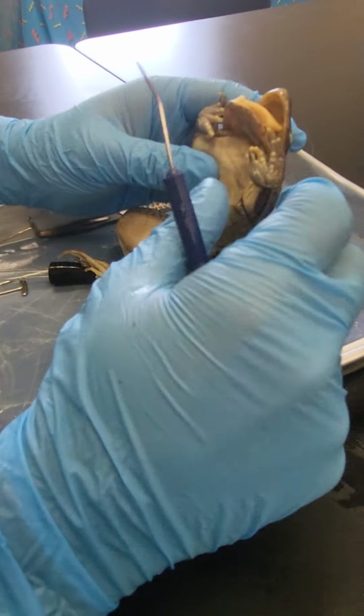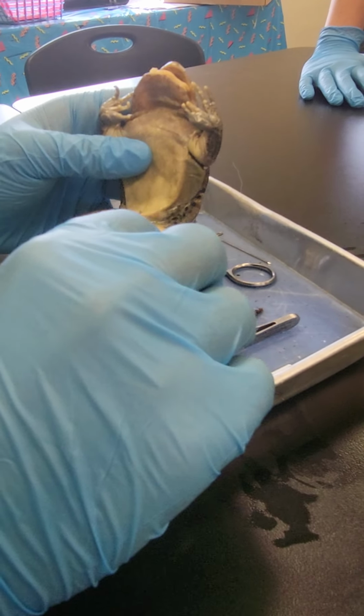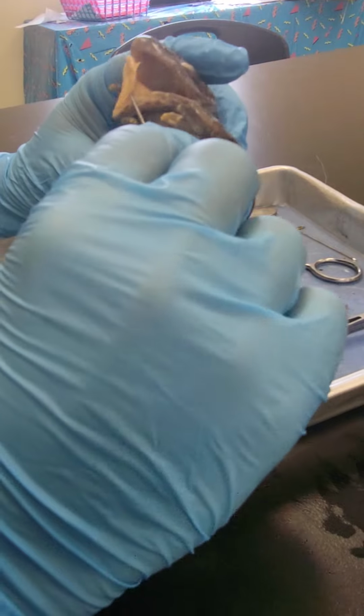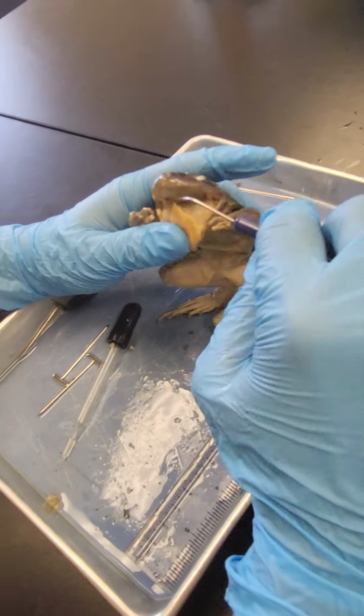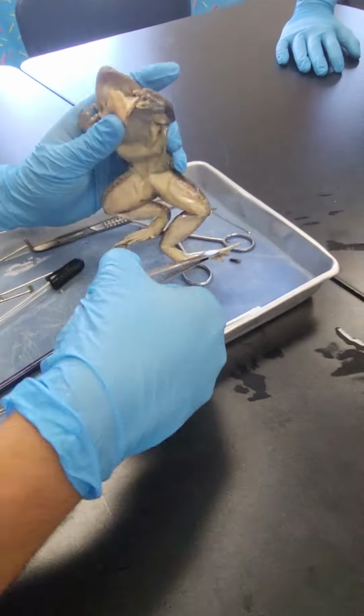Alright, compare the table. The dissection, tubes, tympanic membrane, esophagus, glottis, tongue. Why are you just playing with the tongue? Please don't let it fall out. That'd be nasty. Look at the table. Those are nasty.